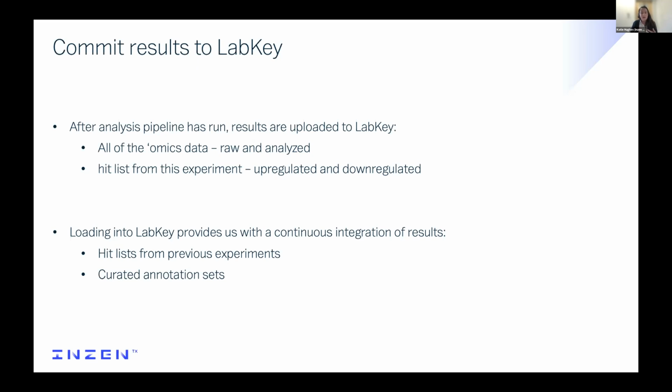And loading these into LabKey provides us with almost a continuous integration of results, where we'll find hit lists from previous experiments and curated annotation sets, and from here we can run very quick GSEA type analyses on some of these previous experiments. And yeah, that is our pipeline in a nutshell.